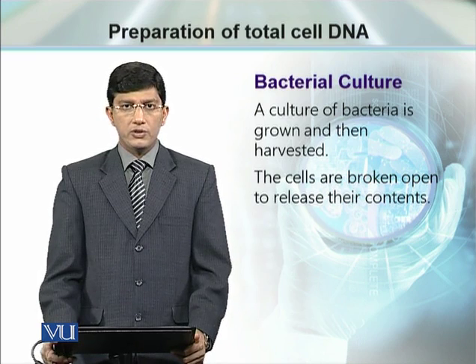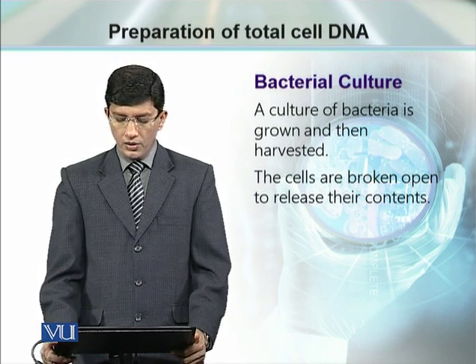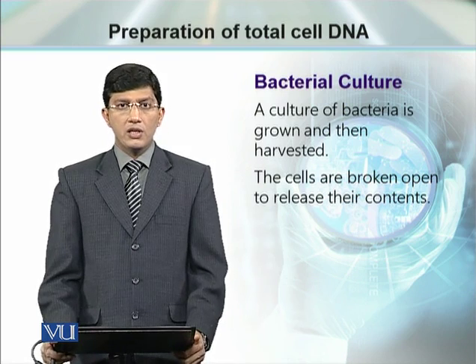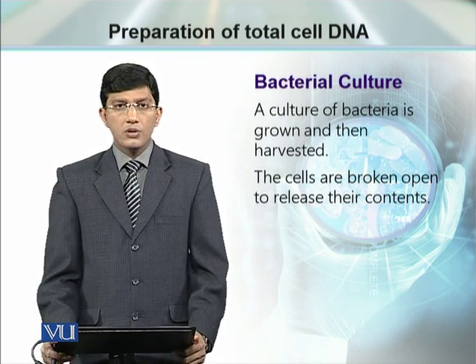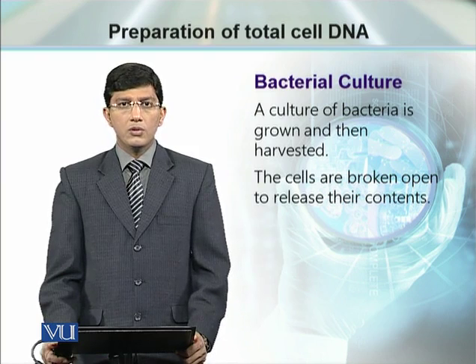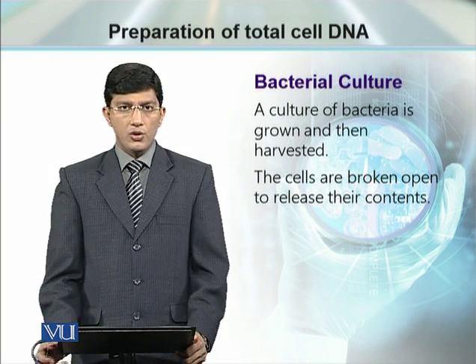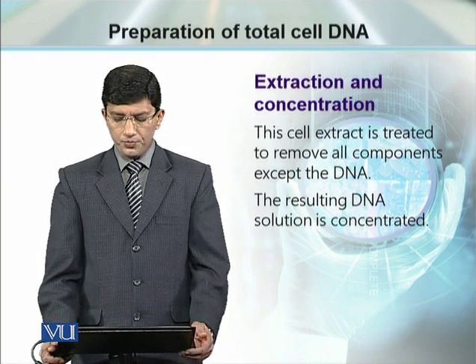We have to harvest those bacteria or any microorganism. Once the microorganisms are harvested, the next step would be to break down their outer coverings, the cell walls, so that the cellular components are released outside in the solution and we can further proceed.